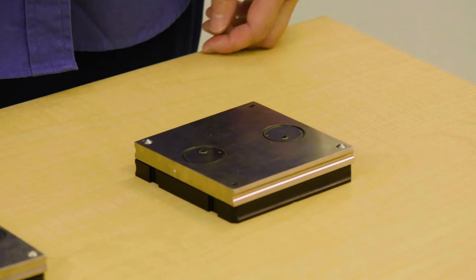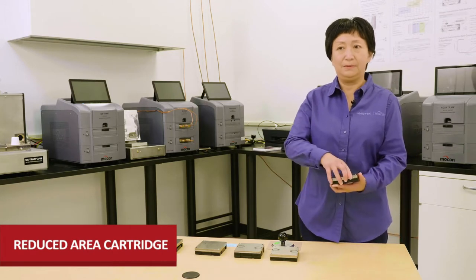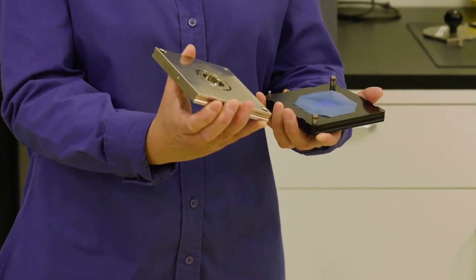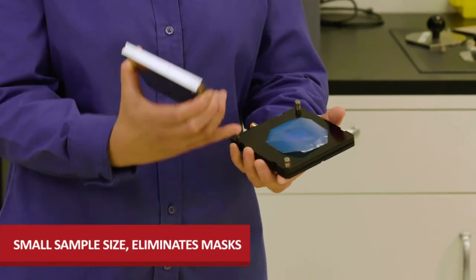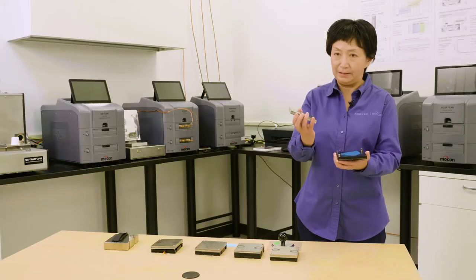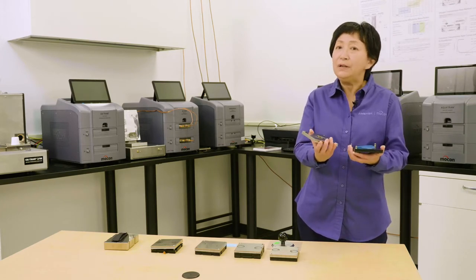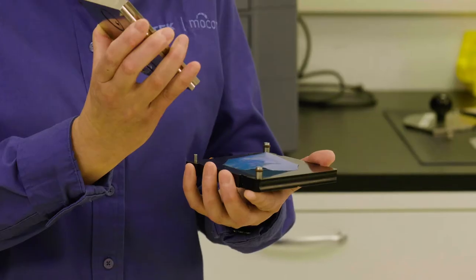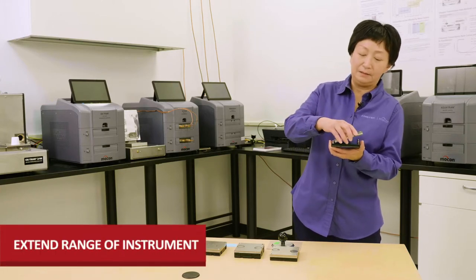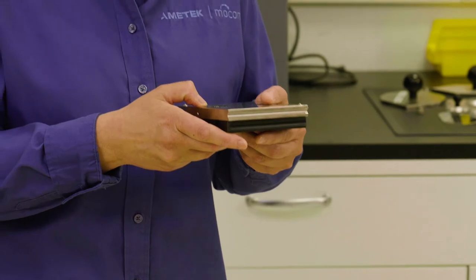The first special cartridge I want to talk about is called the Reduced Test Area cartridge. When I open it up, you will see it has a smaller exposure area. This is for accommodating a small sample that cannot be used on our standard test cell. On the other hand, for some samples that have a high transmission rate that would over-range our instrument, this cartridge is very helpful because it reduces the test area, extending the upper limit of the test range.